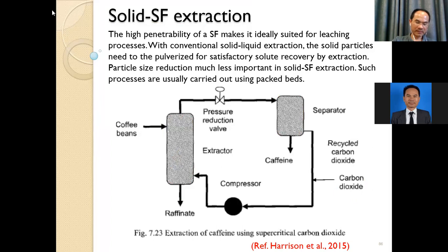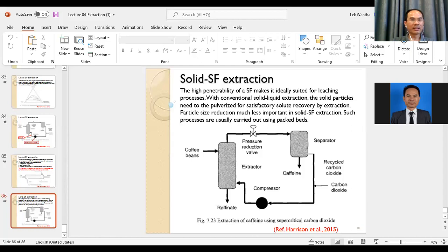And this is the supercritical fluid extraction technique that I show you. It's a simple one, and I will show you some equipment in the lecture note that I show you. Okay, wait a minute.